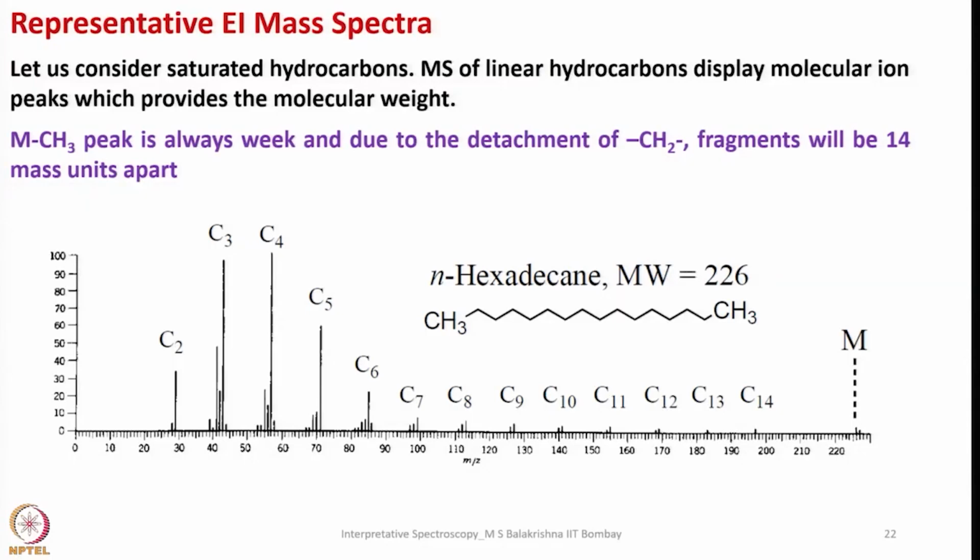In my previous lecture, I started showing you mass spectra of organic molecules. So let us begin looking into more such examples in this lecture. As I mentioned, let me show you some representative, important, and also simple to understand mass spectra of various molecules having different types of functionalities. So let us first consider saturated hydrocarbons.